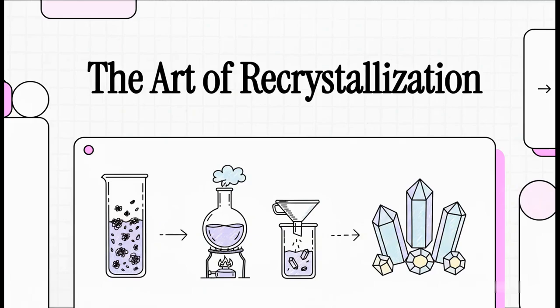All right, today we're going to dive into one of the most fundamental and, I think, one of the most beautiful techniques in all of chemistry: recrystallization. It's really this art of taking molecular chaos and turning it into perfect, ordered purity.